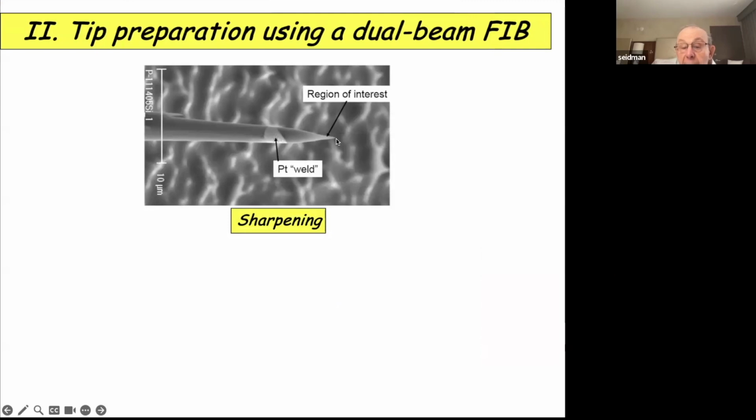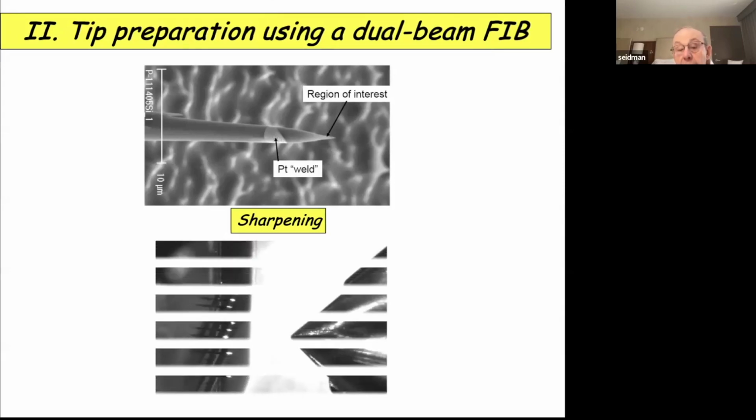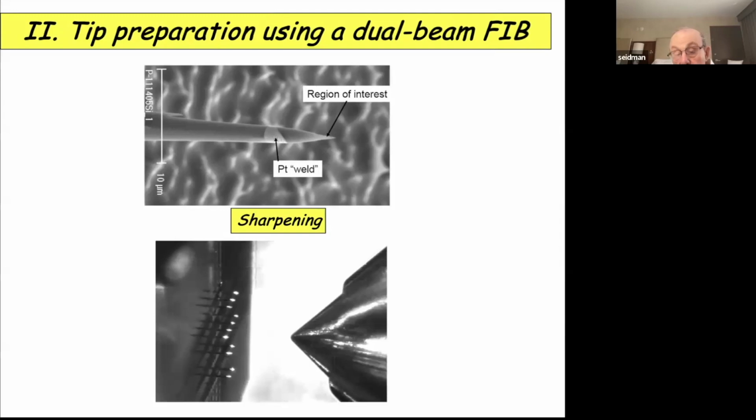And actually in the semiconductor industry now, a former research associate of mine, Sung-Il Beck, works for Intel in Portland, Oregon. They have a facility, and he uses an atom probe as well as transmission microscopy to analyze circuits for them. And here's the local electrode that you can see.